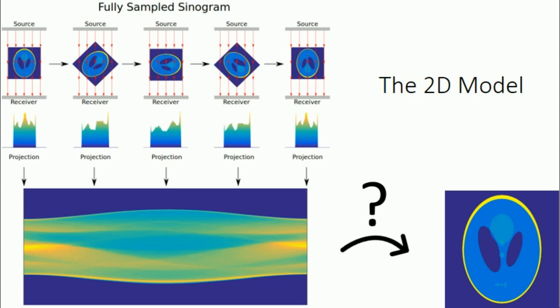Now the process of reconstruction is exactly the problem of calculating the right-hand image given the raw sinogram from the electron microscope. Studying the relationships between a sample and its sinogram is really at the heart of the mathematical process here. Trying to identify how useful features in a sample are represented on a sinogram is hopefully how we can improve methods in the future. Hopefully the fact that the sinogram looks so different from the desired output will convince you this is a non-trivial and actually quite an interesting mathematical problem to work on.